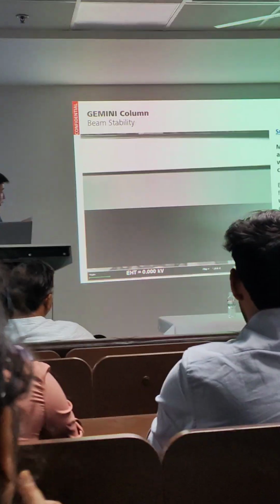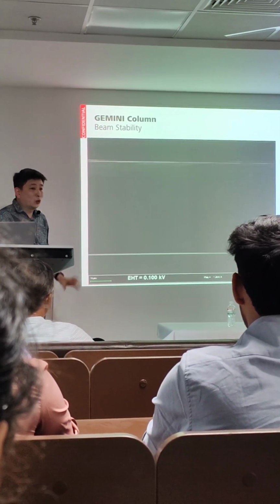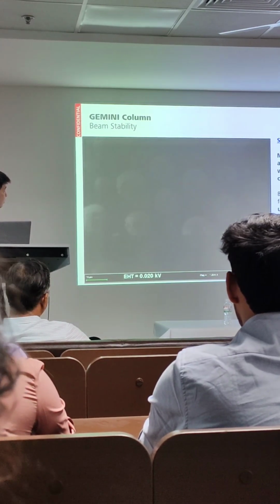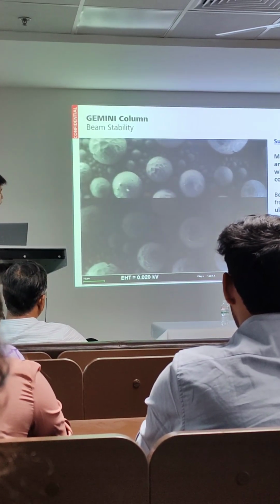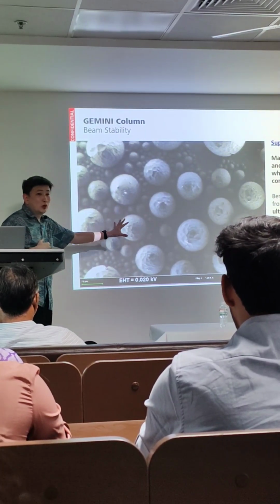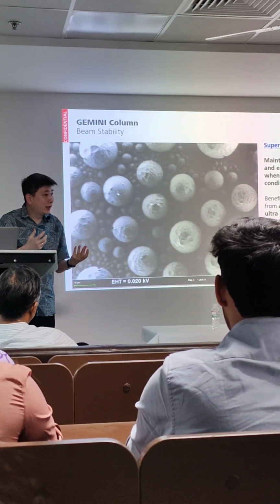And what we did after every change is only to change the contrast and brightness, that's all. Alright? It's a bit dark, but when the contrast and brightness are adjusted, you can really see the surface. It's the same sample, so it depends on what you want, right?